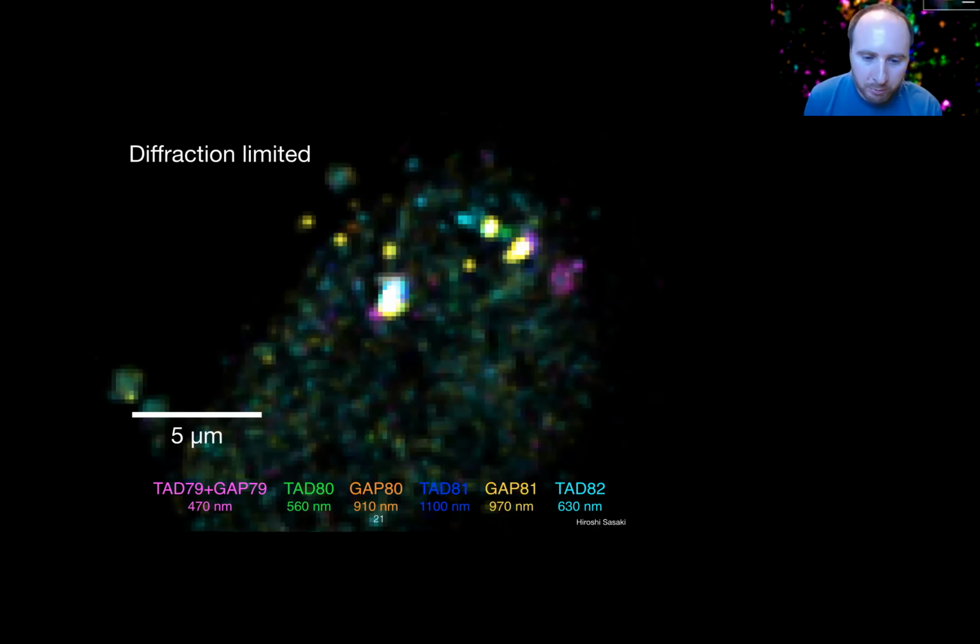So we went ahead and used the same multiplex approach to do 6-color imaging on, in this case, human tissue culture cells. So this is what the diffraction limited version of the imaging would look like. I have the labels down below at the bottom of the slide, and the number you see for nanometers is the focal height of the signal. So we just took a single 2D plane of a 3D object, where in this case, we were able to get the bulk, but not all of the signal. And as we moved down the chromosome, this actually moved a bit in 3D space.